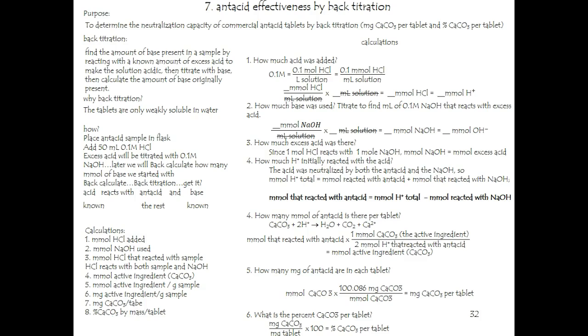One difference today is that we'll be using not a phenolphthalein indicator for the titrations, but one called thymol blue. And when you do that, it does a funny sort of color change. The solution will turn pink. I'm reading from the manual, step number 7. Solution turns pink, then faint pink, then peach. At this point, add it dropwise until the yellow end point is reached. So it's the yellow color that you want to use. And if you want to be exact, try to choose a yellow color that has just a hint of green in it.